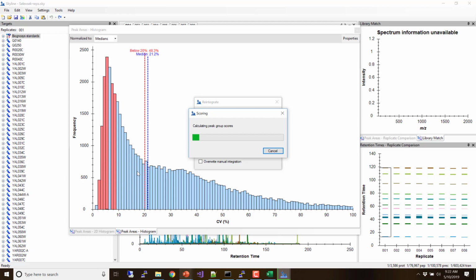Other questions? So what we're going to do is basically create the refined document, and I think we're not going to have time to go through actually getting the reports. There are zipped reports.